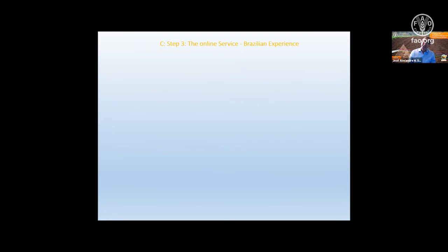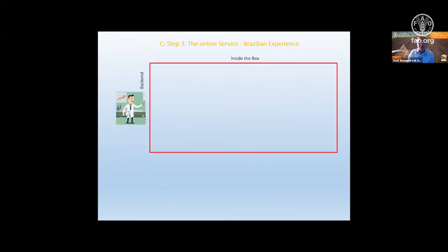Okay, so we pass through the teaching and now we go to the online service, the Brazilian experience, because now I can show them, I can ask them to start to use it. So I'm going to show how we made this online. It's a platform. You can see the platform on the chat.